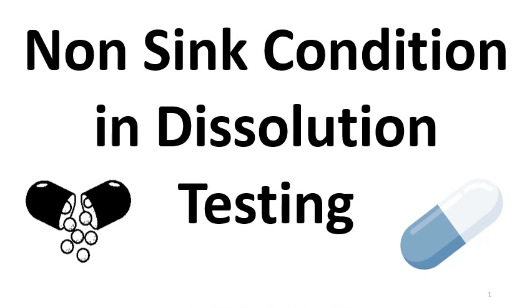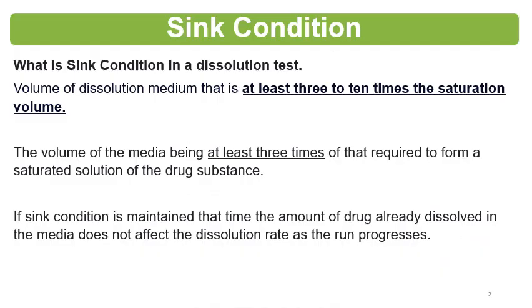Also, the sink condition is required to be proved for performing the dissolution testing, and always the sink condition is a part of the dissolution development report, but non-sink condition can also be used for dissolution testing, and it has some requirements and uses.